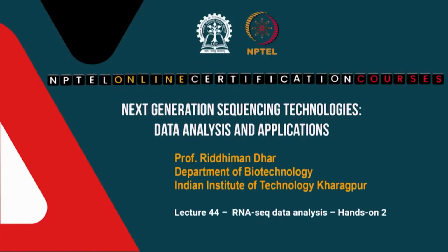So, what we are going to do now is we are going to implement all those, right. We will go through a hands on where we will actually analyze real data sets, right. So, we will take one data set and we will analyze this data set through all these steps. Okay. So, that is the agenda, which is what we will start with this class, and subsequently a few more classes will be devoted to this hands on.